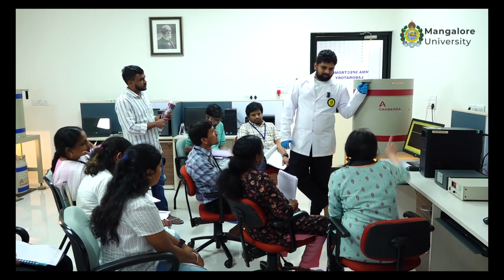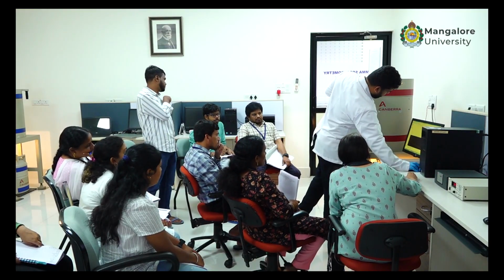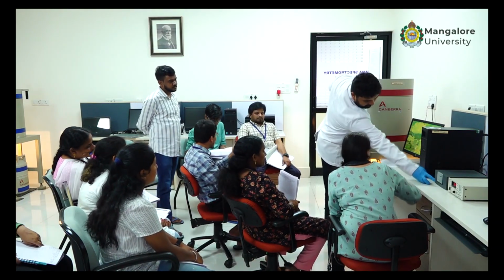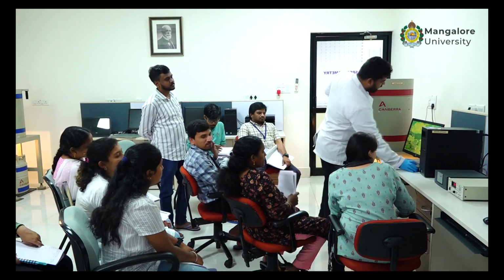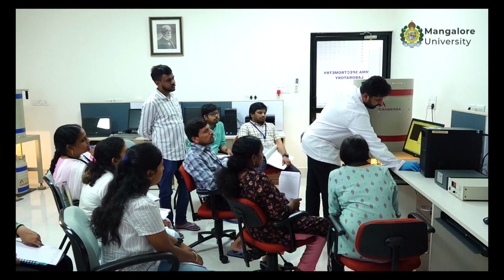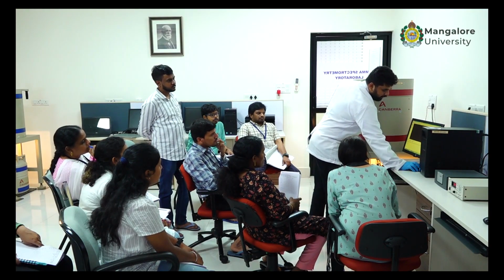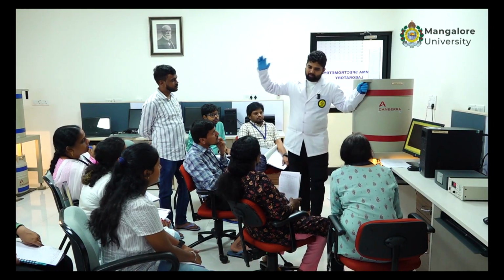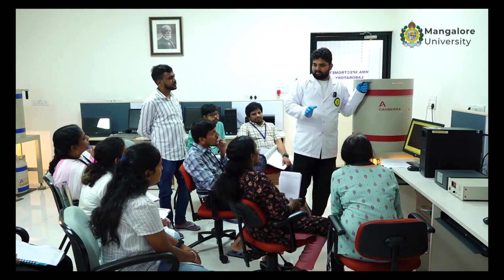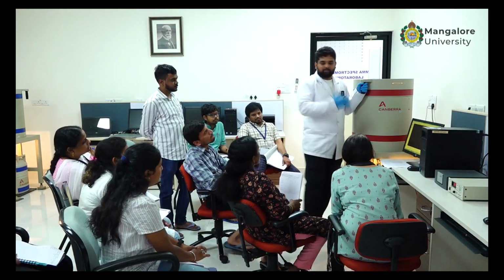See, suppose now the counting is over here. Okay, I'll close. No, I have not stopped it. So here you can see that it is still acquiring. The acquire light is on. So that means even if I shut down, there is no effect to the detector counting. How do you open that one then? Same way. It is just like something already playing on your TV channel and you are just switching on that channel. When I switch on that channel, I'll get whatever is happening over there, the program whichever is being run.